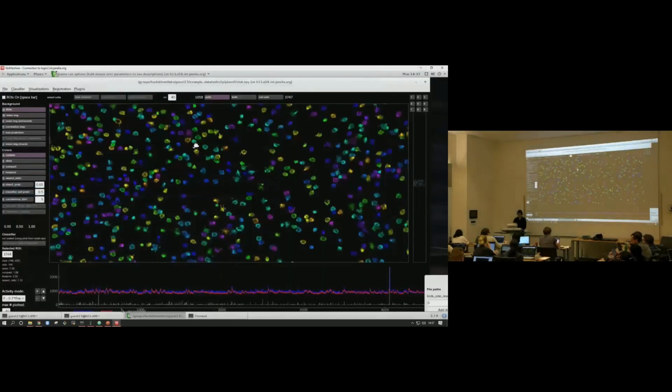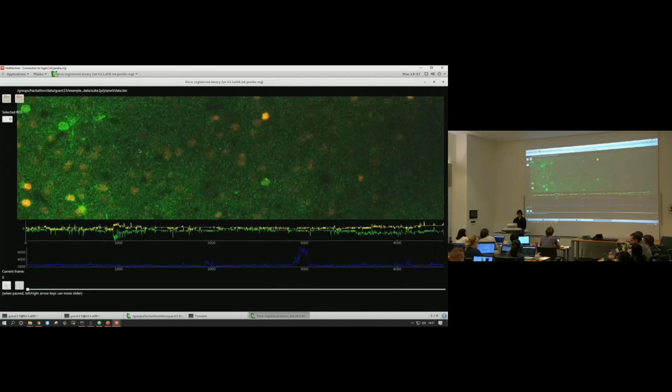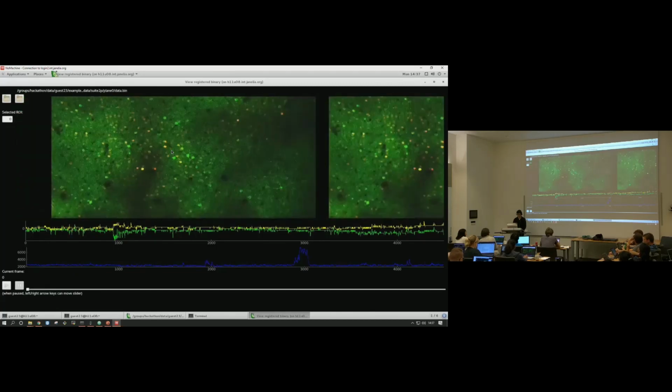All right, now let's talk about registration, because Marius is very excited about it. Whenever you work with data, you want to be really sure the registration works well, because it should work near perfectly, right? Because that means all your issues afterwards are going to be small. Hopefully. It takes a weight off, just to see that at least registration works nicely.